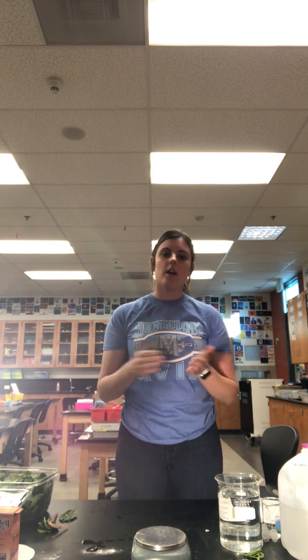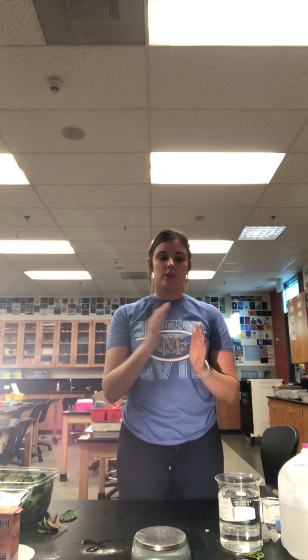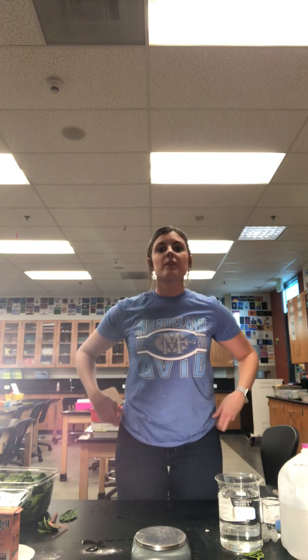In this experiment, the independent variable, or the variable that we're changing, is the time. And so our x-axis is going to show time, so it's going to be 0 through 15 because we are recording for 15 minutes. Our y-axis is going to be number of leaf chads to rise, and so that's how we are measuring the rate of photosynthesis.